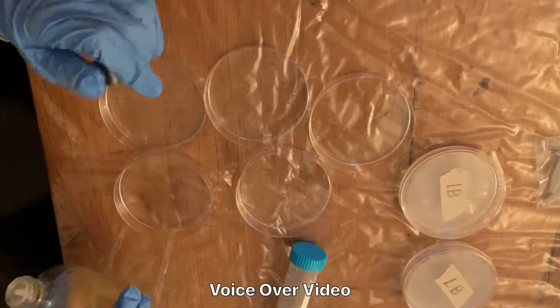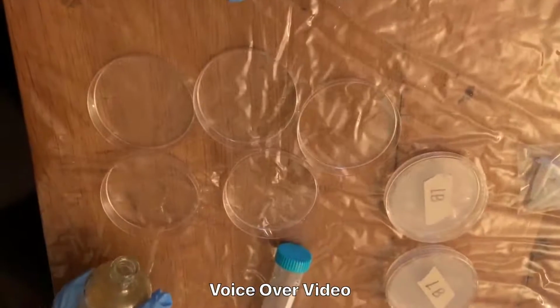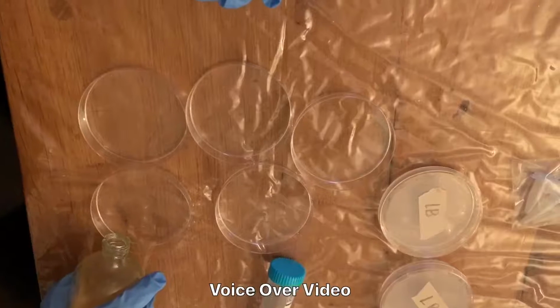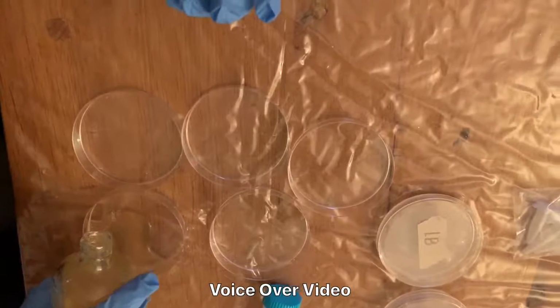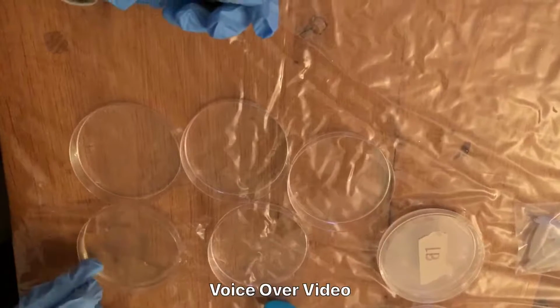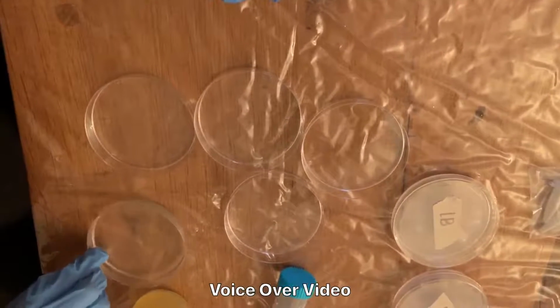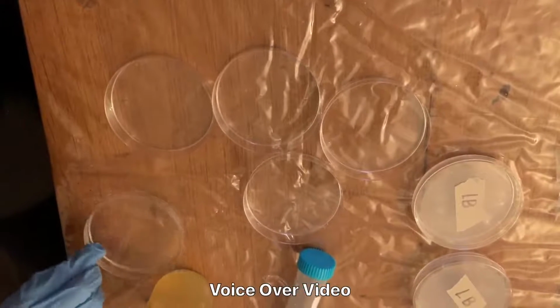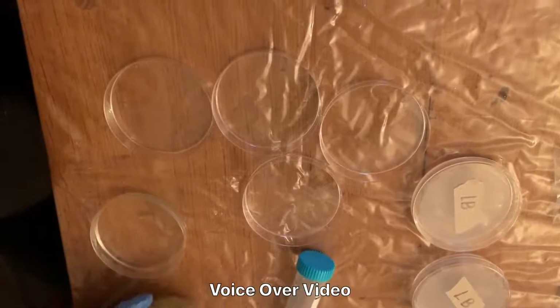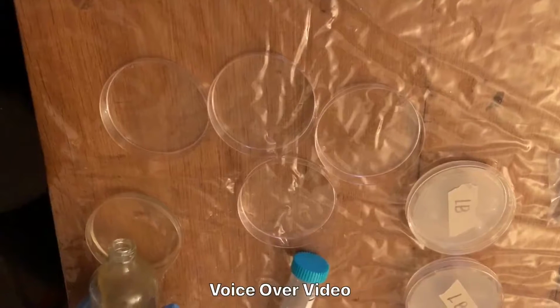And then I'm pouring it into the little plates. I had a little difficulty making it even across the entire plate because I couldn't fill in some spots. But I eventually did. And I filled all the plates. So I started all the 5 plates.